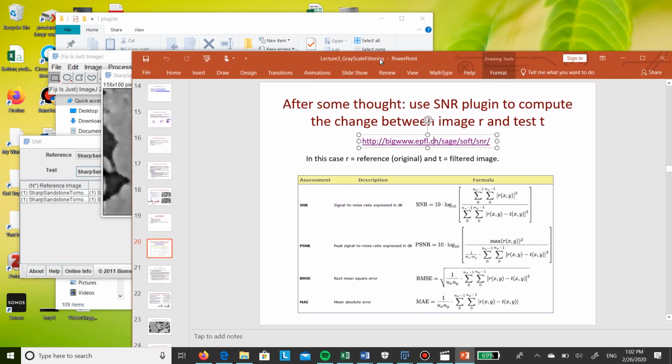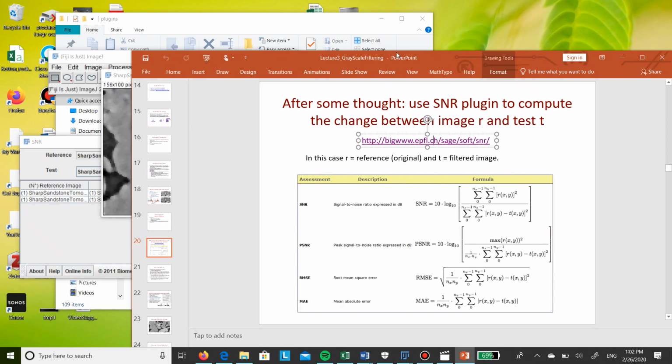I was discussing this practice with a colleague, now at University of New South Wales, Krista Farnes, who's been in this area for a while, and at some point he graduated, I believe, from Australian National University, or that's where he worked for a while, I don't know anymore. But they actually had, in the processing, 4 people who could sign off on filtering and segmentation, right?